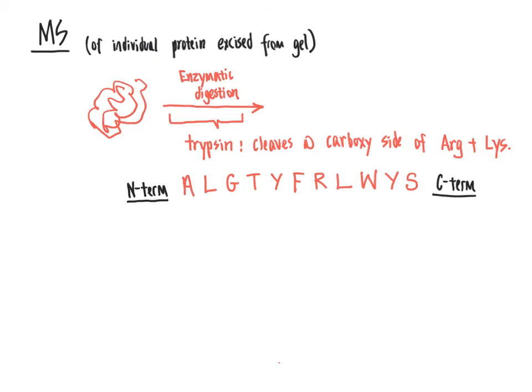That means that toward the right-hand side of each of the individual amino acids here is where you would find the carboxy side. And so what we do is we go through and we look for the one-letter abbreviation for arginine. Arginine is R, so here would be our R amino acid.